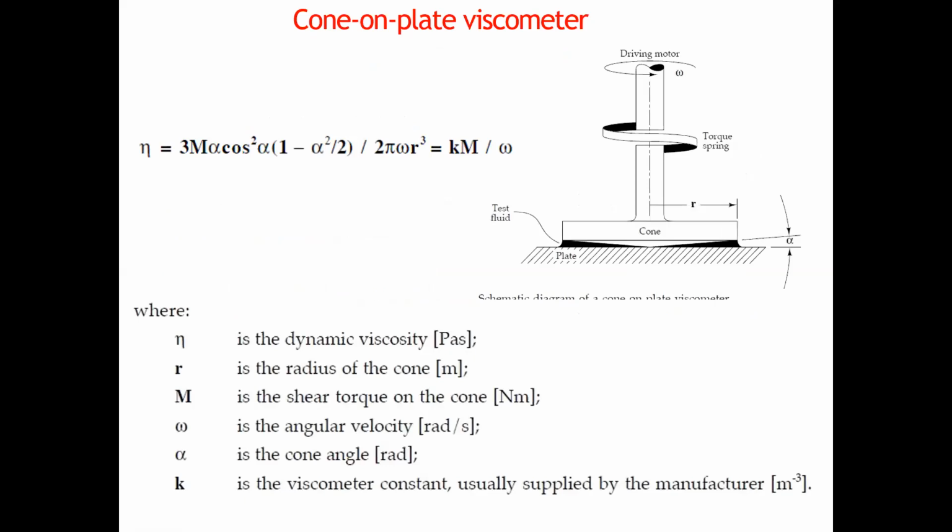Cone and plate viscometer. There is a plate, a cone, a torque spring, the driving motor, and the test fluid and all. The formula is given for this.